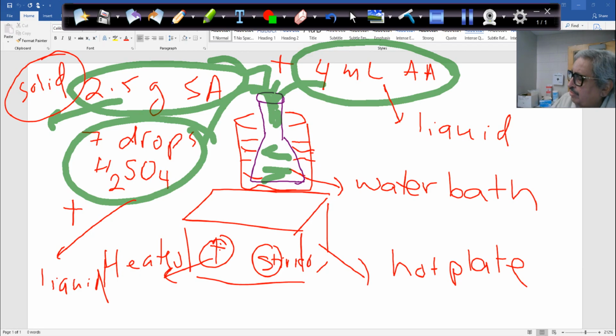Now what you will do here, you will take it and cool it. Meantime, you will have a metal plate or a metal container here. You put ice in it, and some tap water for cooling. So you take this Erlenmeyer flask and put it inside the ice. You let it sit for a couple of minutes, 10 minutes, and then you will add to it from the ice water you have, maybe 4 mL at the beginning, and then you'll add more, maybe 10 mL or 15 mL. It does not really matter.